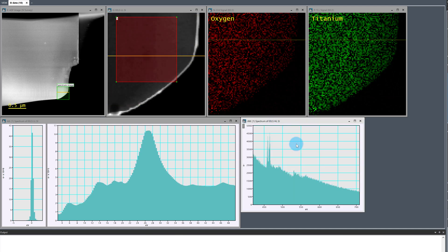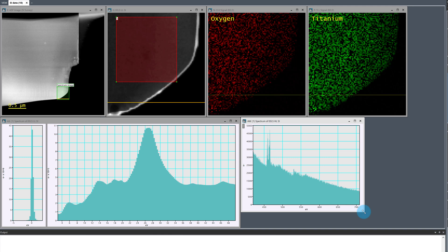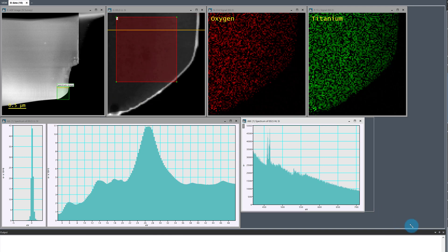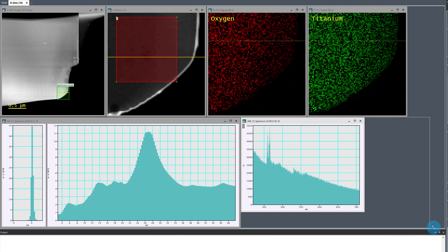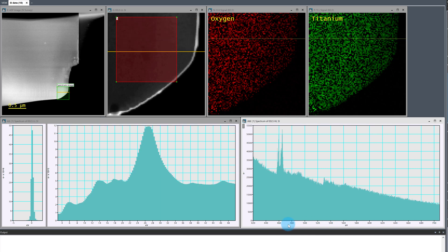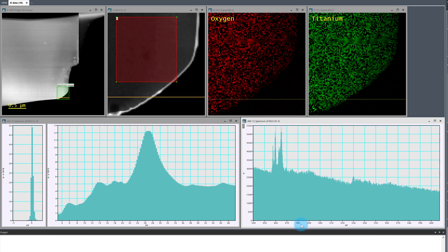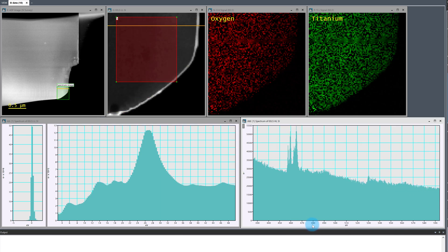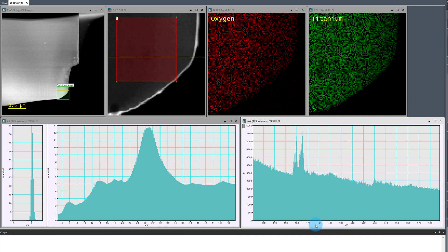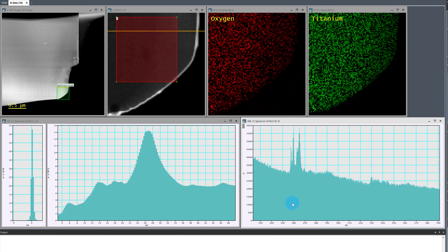We can see really good signal to noise ratio in the low loss and the titanium L23 edge after around 10 spectrum image passes. I'm easily resolving the multiplet peaks on the titanium white lines with this energy resolution.